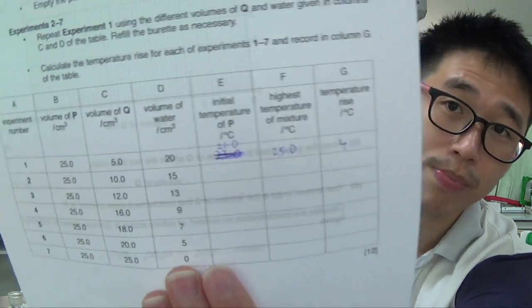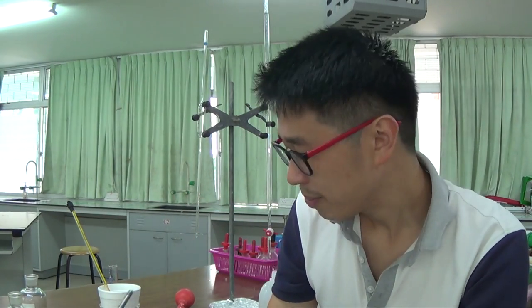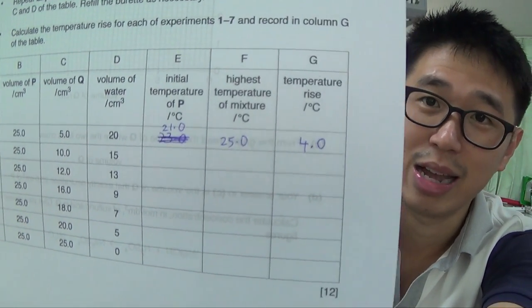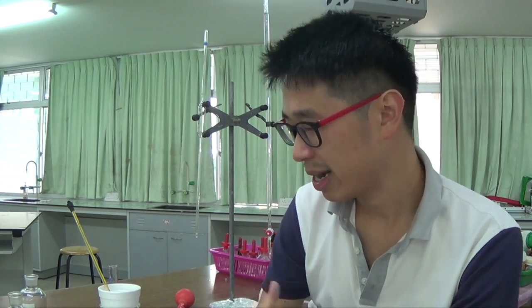But 4 is definitely wrong based on what is appropriate. Our data was collected to 0.5 degrees Celsius, so I had a 0.0 or 0.5 in my initial or final temperature, which in this case is just 0.0 and 0.0. So when you do 0.0 minus 0.0, you don't see it on your calculator, so you should by right, instead of 4, know better than the calculator. Your experimental skill tells you it's not just 4, it's 4.0 degrees Celsius. These are the little things that you look out for, not just for volume, but for temperature and other things. It's about the appropriate number of significant figures. These have been very clearly stated in the syllabus, as part of your experimental skills, data collection.